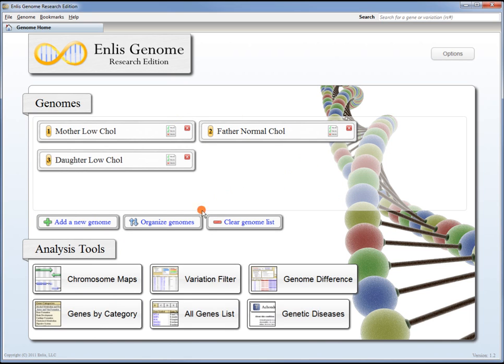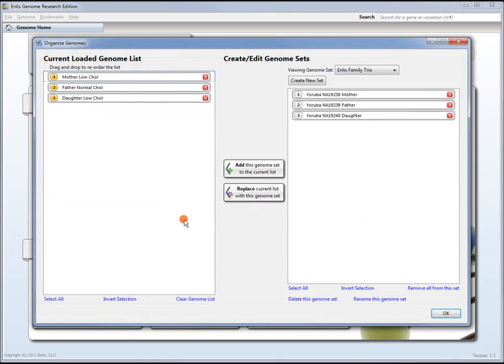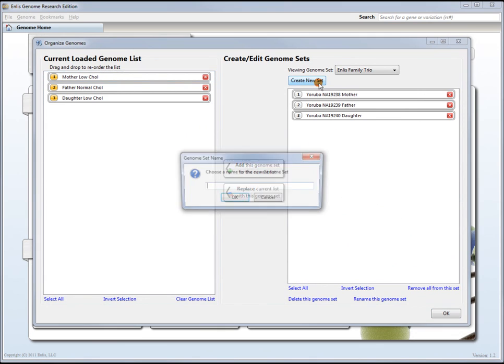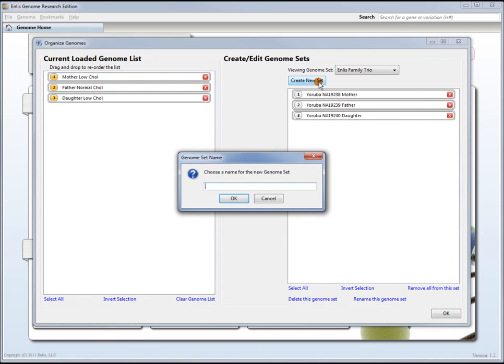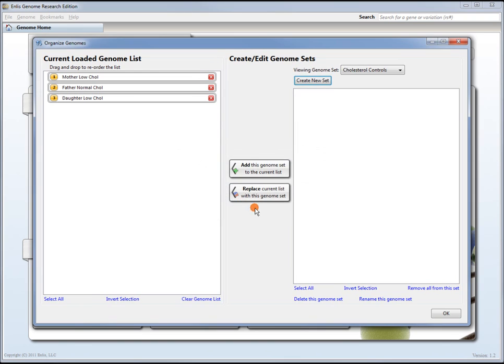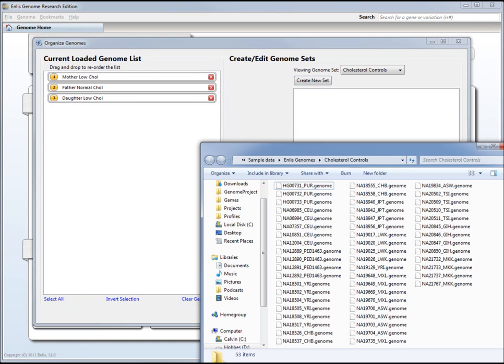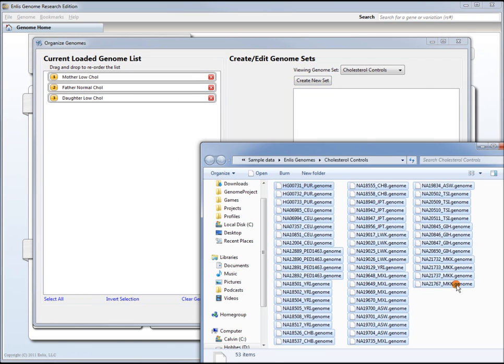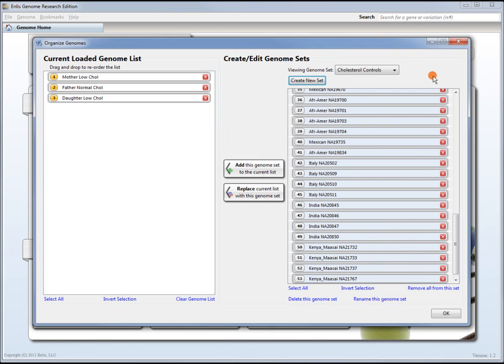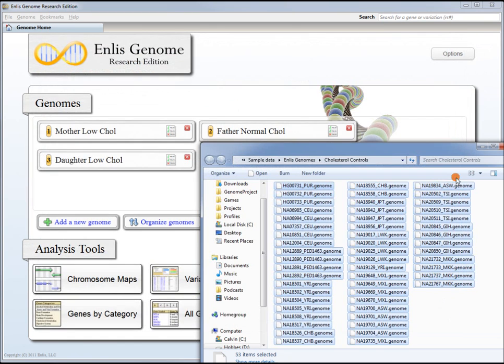I also mentioned that we have 53 control genomes. We might want to create a new genome set so that we can search those all together. We'll call it cholesterol controls, and we'll select all 53 of those genomes, drag that into the new set, and now we can use that for searching.